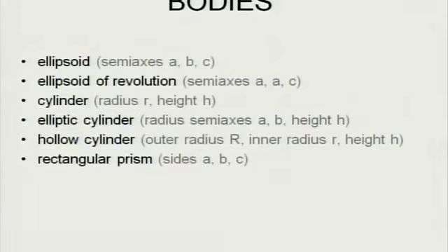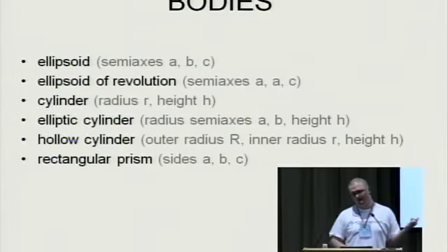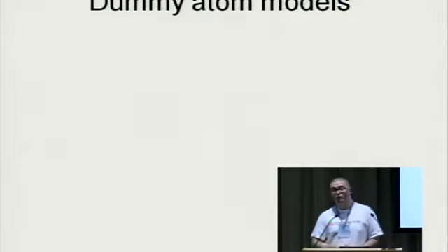of this is used when you have, for example, lipids and proteins together, and you need to model that. That is fairly sophisticated. However, bodies is like a very low resolution overall approximation of the shape. And let us look at something more interesting.